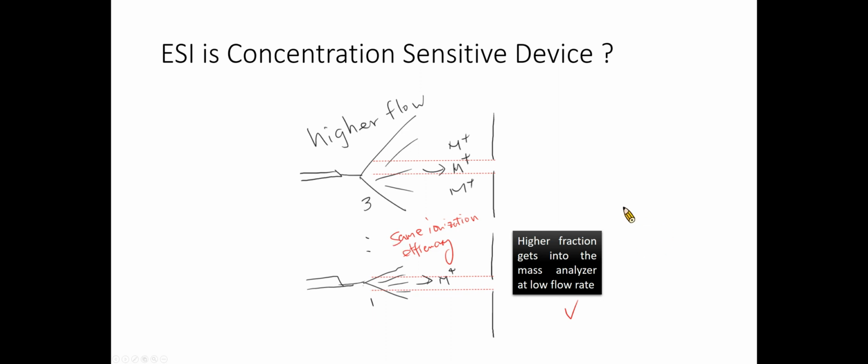Ionization efficiency remains constant at different flows, but the fraction of the available ions passing through the orifice at the atmospheric to vacuum interface increases as the flow is lowered. The smaller columns mean a higher absolute sensitivity, and the lower flows mean longer acquisition times on a given amount of sample. Therefore, the post-column stream splitting does not result in a significant signal loss.